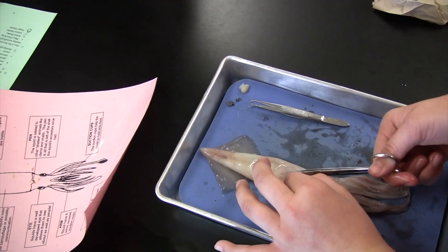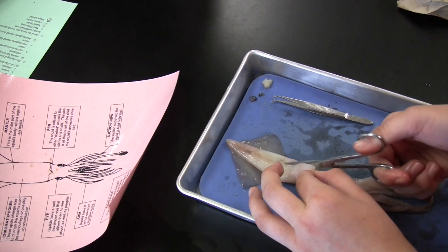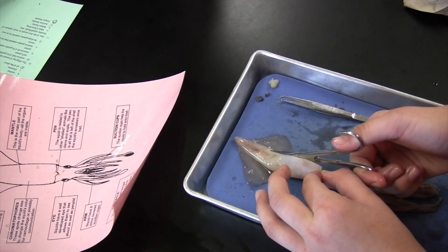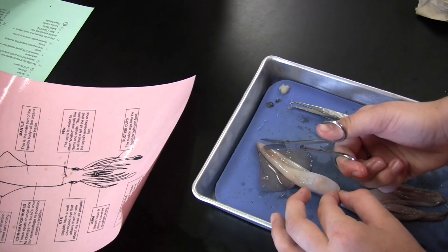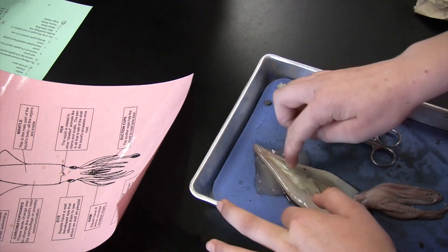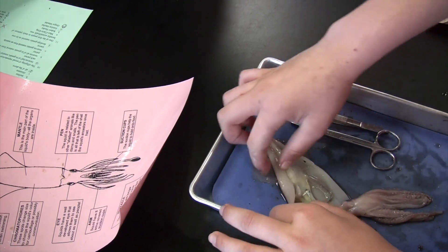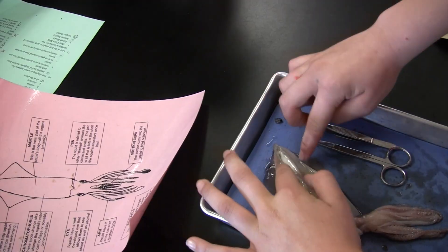So you just make a cut, making sure that it's not too far down. Then you have to go all the way to the end. Then you open it and spread the edges.